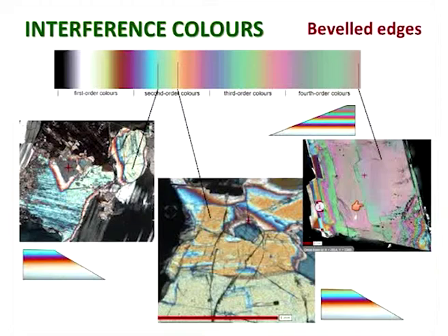And I've tried to represent exactly what you see, going from the thin part of the crystal at the thin end of the wedge up to the maximum color. Essentially that shows you the maximum color at that beveled edge. You can see these bands of color here really quite nicely. Sometimes they're quite narrow, and sometimes quite broad, and you can pick your way through them. So I found that a really useful way of defining what the maximum color is.